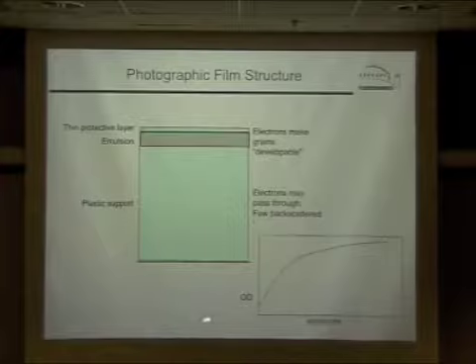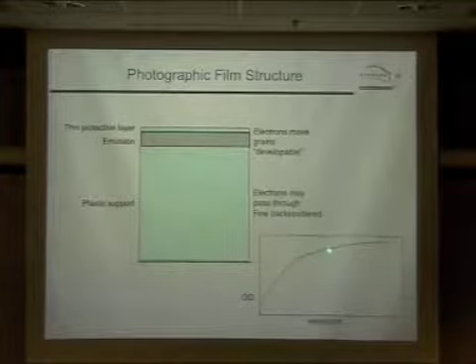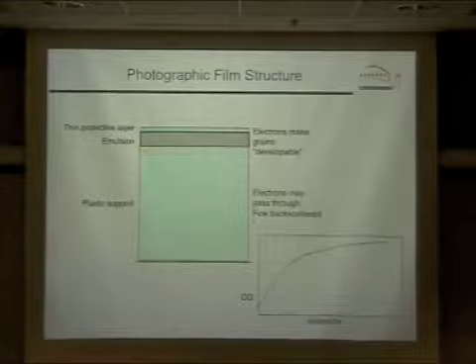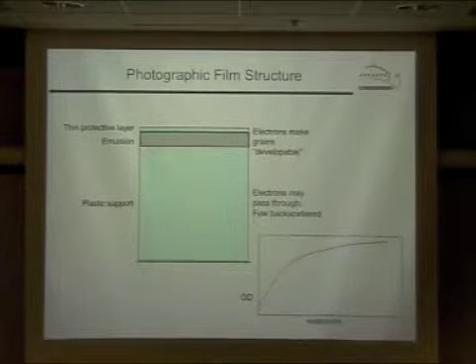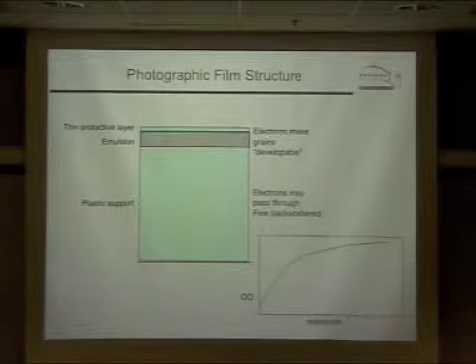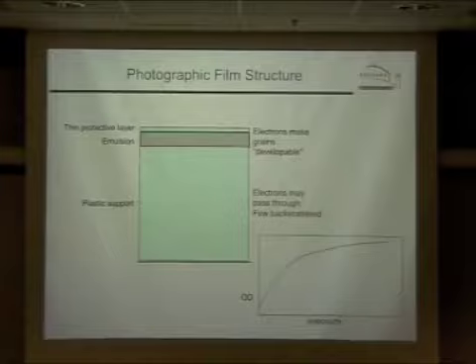And as you get higher and higher exposure, the OD plateaus and reaches a maximum level that's determined by the maximum amount of silver halide that's put into the emulsion. With the film that we use, the Kodak SO163 film, that's pretty opaque.